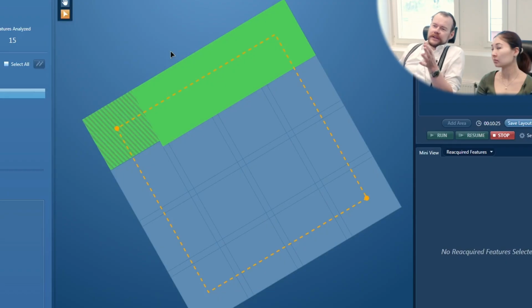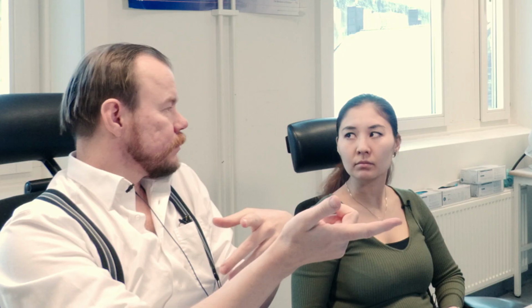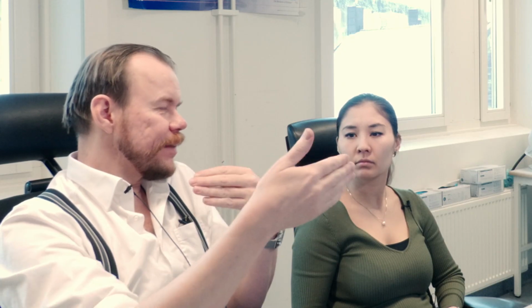When we talked about, I mentioned that this is problematic when you have a large view field, low magnification. There is something similar to that, and that is depth of field. If you have a sample that is very rough, on this machine there is a scan mode called the depth. If you choose that, it optimizes so you get a little bit more depth of field.